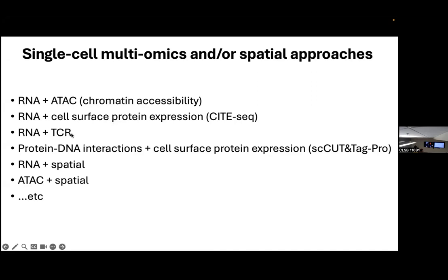We also can look at, for T cells, you can profile the T cell receptor repertoire using their TCR VDJ workflow. And that too is paired. So you get the gene expression profile as well as the TCR clonotype information on the same cells.